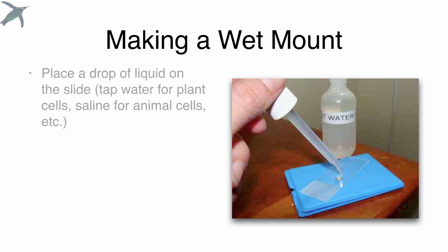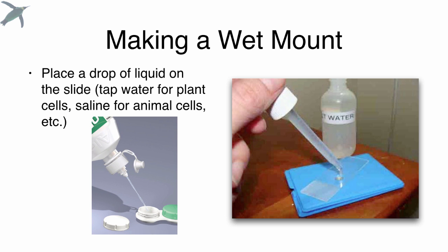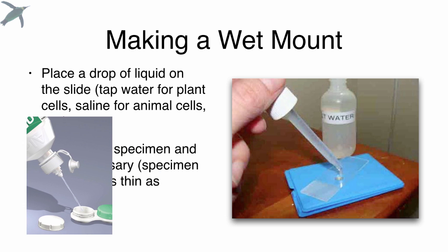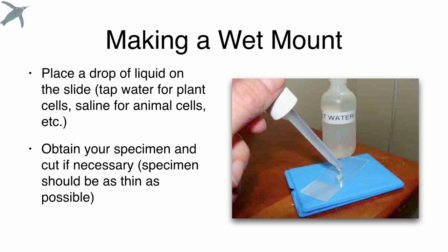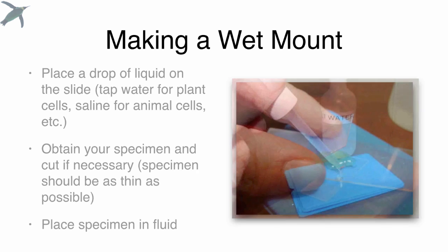You will probably have to make a wet mount. What you're going to do is use a drop of liquid. The liquid you use depends on your specimen. You would be using tap water for plant cells, saline for animal cells. If you don't have saline around, a contact lens solution will work. Get your specimen. If you need to cut it, especially if it's a plant, you want to make that slice as thin as possible, and then just place the specimen in the fluid.